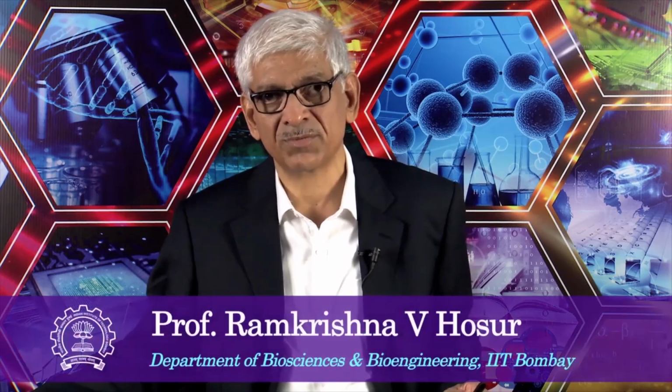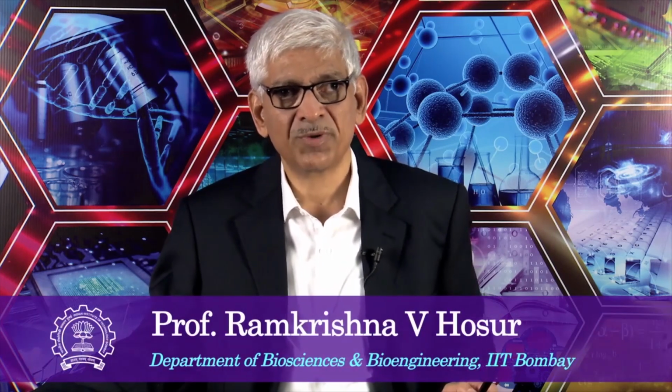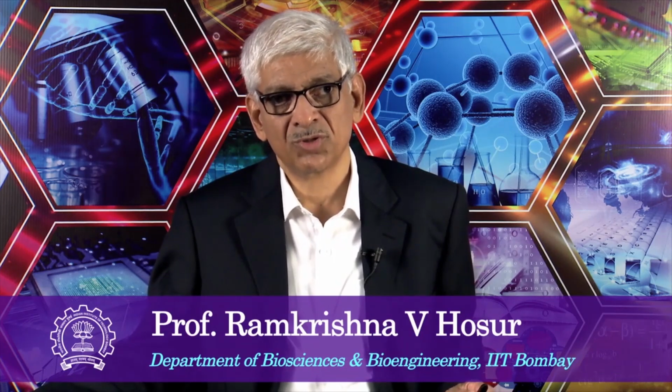Okay. So, I think we have covered here important heteronuclear experiments, and also we have shown how to combine these heteronuclear correlations with proton-proton correlations to extend the information content of the two-dimensional spectra. You can relay the magnetization within the proton network either using the TOCSY scheme or using the NOESY scheme, and you can combine this with the heteronuclear correlations either through the HSQC experiment or through the HMQC experiment. So, this will be extremely useful in obtaining resonance assignments in small molecules, big molecules, and likewise. So, I think we will stop here.